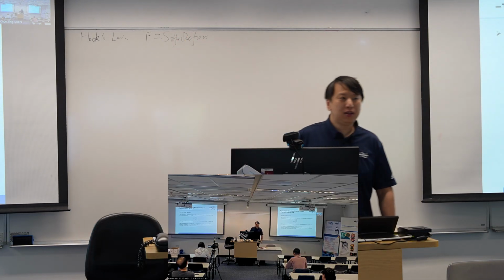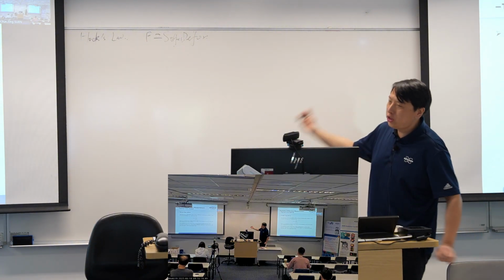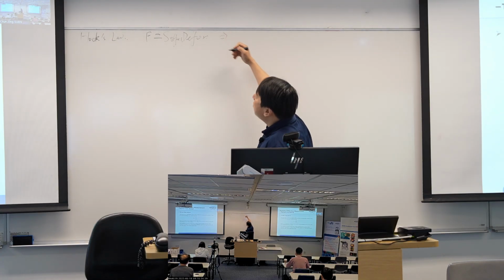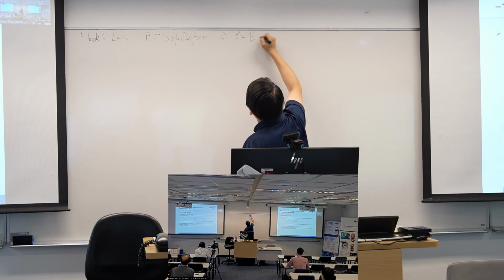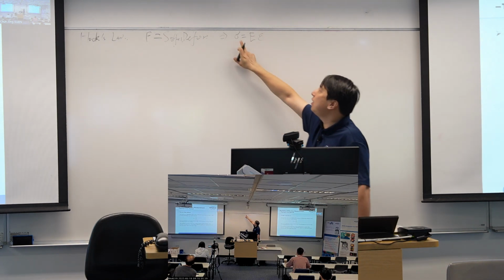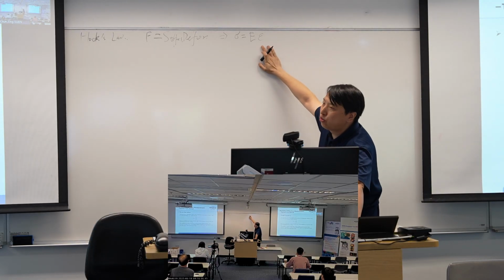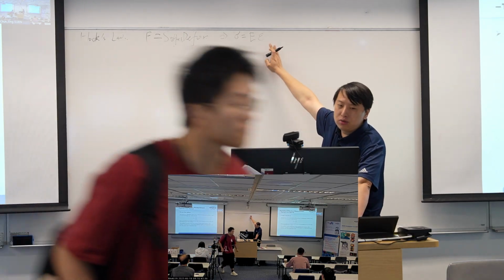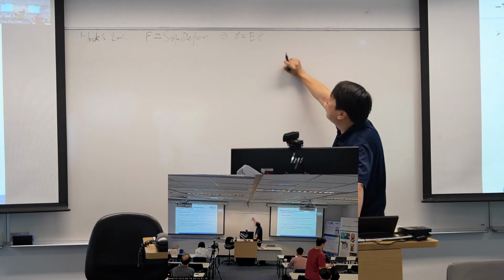But the stiffness includes both shape and the materials contribution. So for material, we would change it to this formulation, and the sigma is the stress, and the epsilon is the strain. When we consider the direction, the sigma and the epsilon should be tensors. And the modulus itself, of course, should be a tensor.